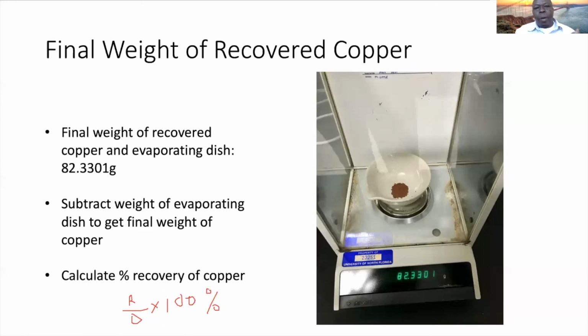To state where copper is, and to fill in the information regarding the color of the solution or of your product, you have to watch the simulation. With that, you shouldn't have any problem doing the calculation, turning in the data sheet next week via Canvas.